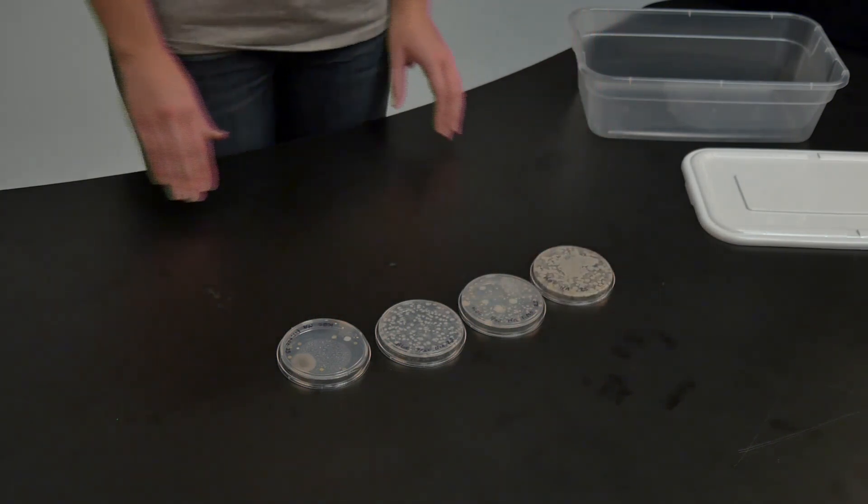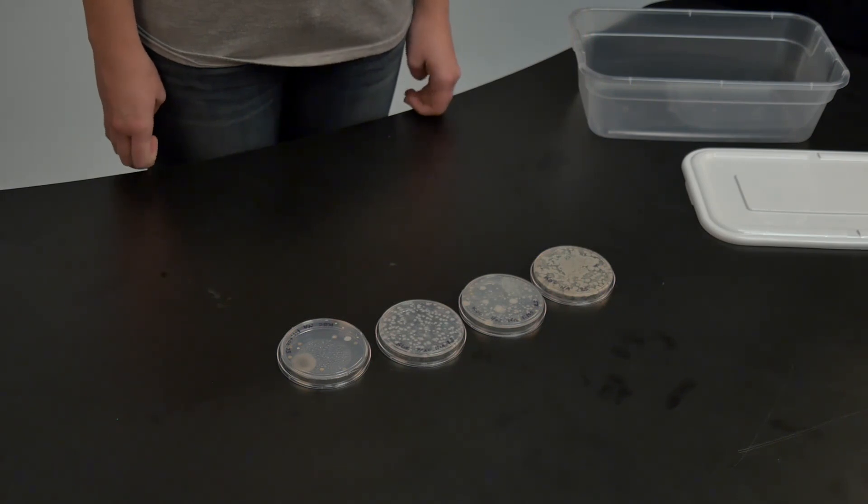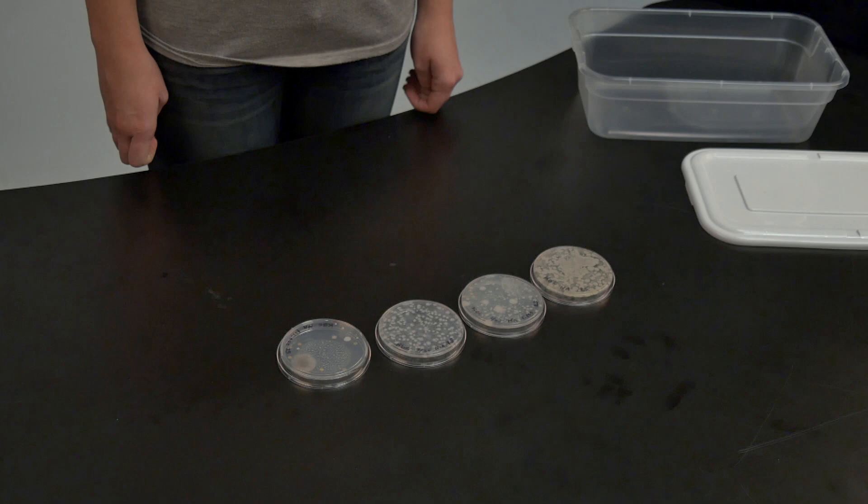Once you have finished counting the number of colony forming units on your petri dish, your instructor will show you how to calculate the total number of bacteria found in your original soil sample.